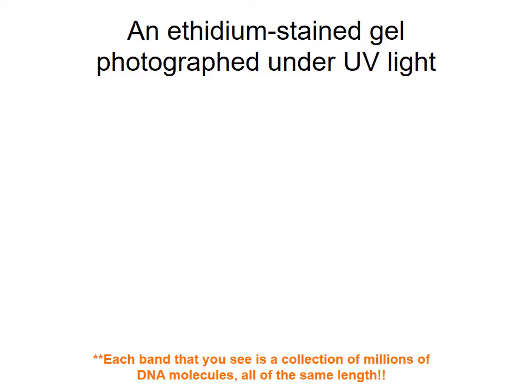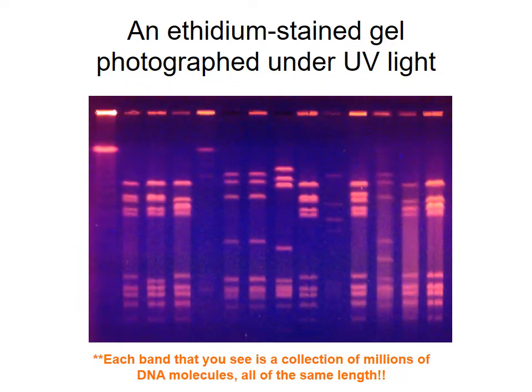All right, we left off part 2 here for gel electrophoresis. We left off talking about this picture right here, which is a picture of the gel, and you can see that it's been stained, and then under ultraviolet light, you can see that the bands of the DNA are showing very nicely. And remember, this is the negative end, this is the positive end. These are our DNA wells. And we have run this gel, then stained it, and now we're taking a look at it.